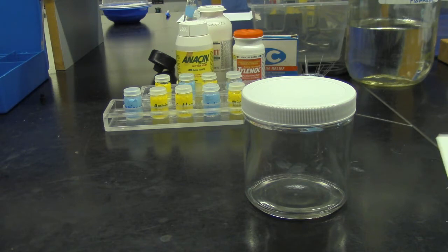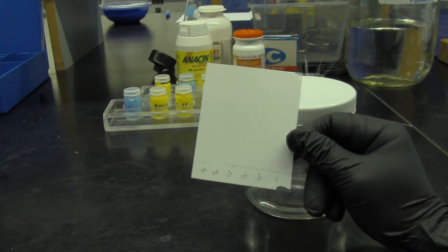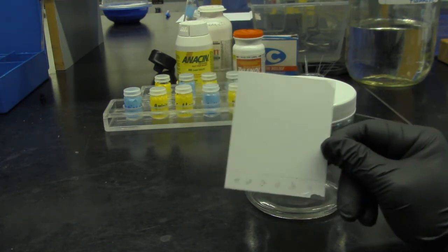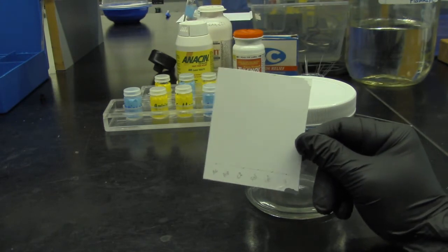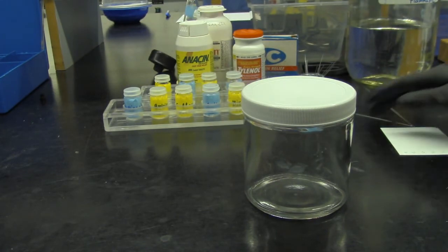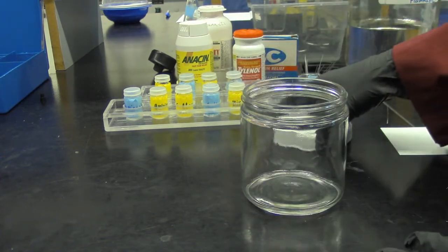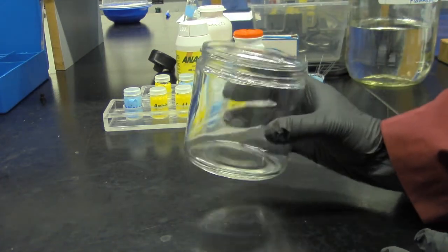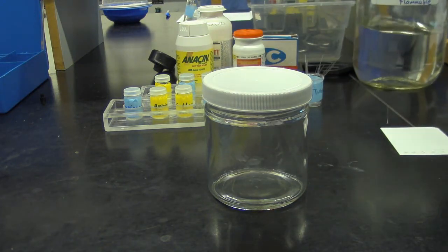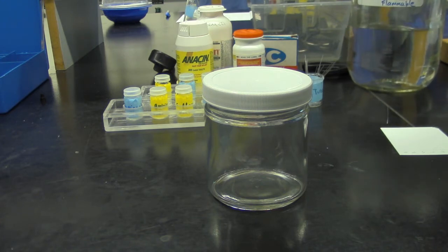So I have completed all the standards and unknown mixture spotted on TLC plate, right? And they are all dried, which is good. You don't want them wet, so all the spots should be dried as well. So next I'm going to prepare the TLC developing chamber. So the developing chamber is basically this wide mouth glass with the lid. And I'm going to pour in ethyl acetate with 0.5% glacial acetic acid, right?